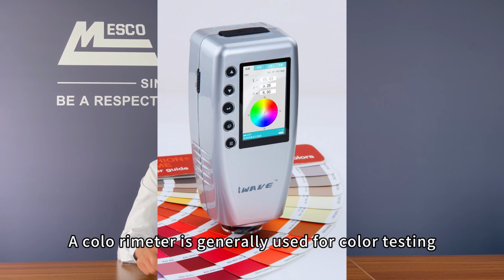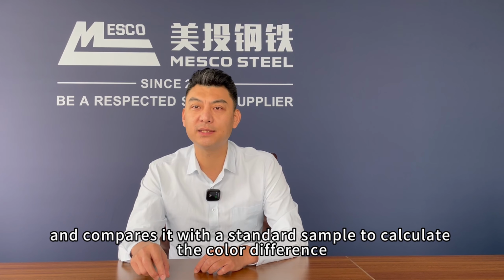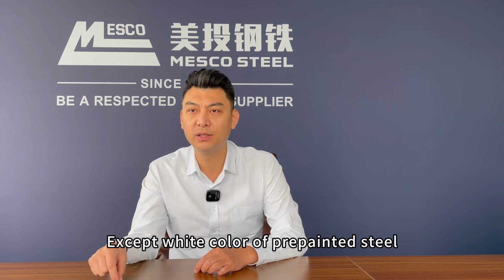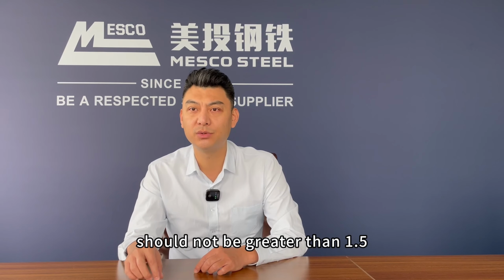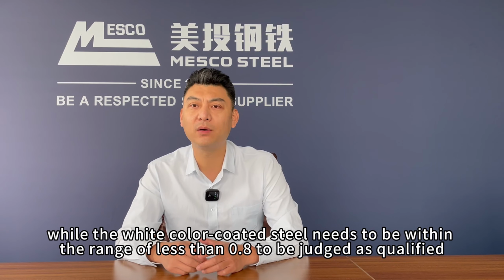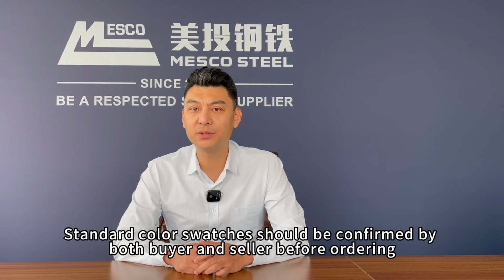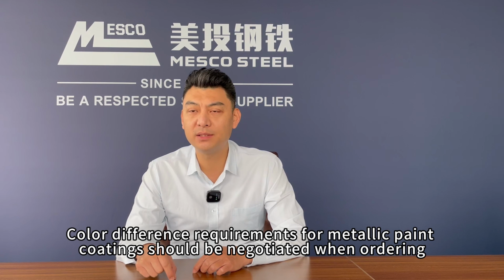Color difference measurement. A colorimeter is generally used for color testing. It measures the color value of the paint coating and compares it with a standard sample to calculate the color difference. Except white color of prepainted steel, the delta E value of the color difference between the coating and the standard color sheet should not be greater than 1.5, while the white color coated steel needs to be within the range of less than 0.8 to be judged as qualified. Standard color swatches should be confirmed by both buyer and seller before ordering. Color difference requirements for metallic paint coatings should be negotiated when ordering.